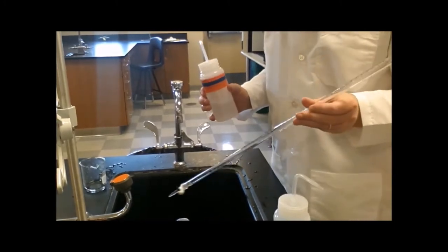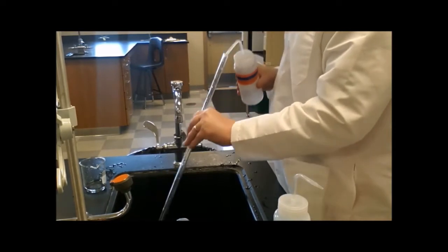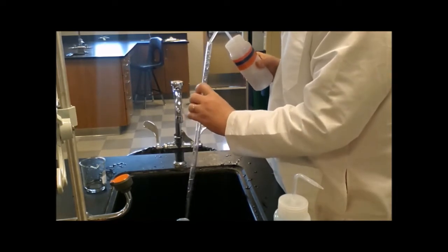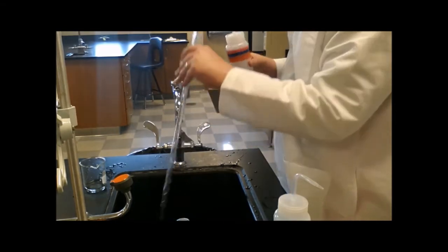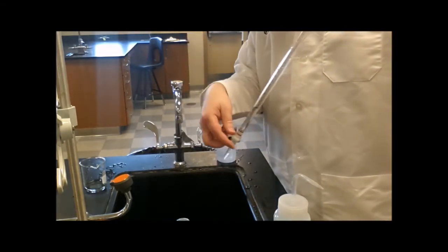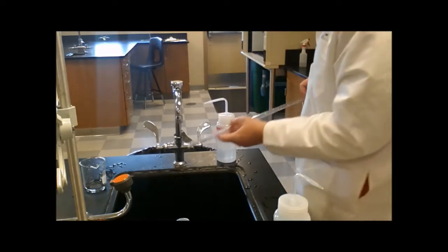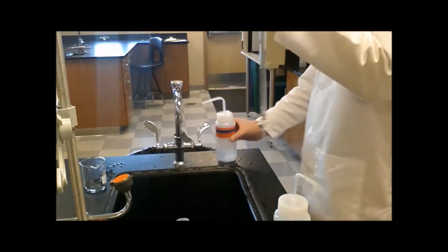All right, I got it all nice and rinsed out. I'm going to do my final rinse with DI water. So I'm going to take the DI wash bottle and rinse out the inside of the burette. Remember to always twirl, twirling towards victory. Okay, get a little bit of DI water in there. Doesn't take much. Don't forget to rinse out the stopcock too. Then you can turn it upside down, twirl it and dump it out, and that rinses it out too.